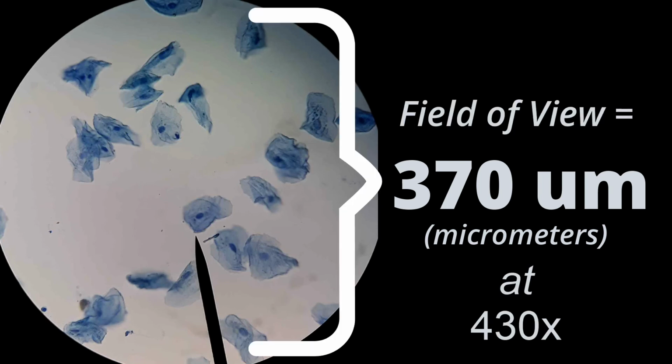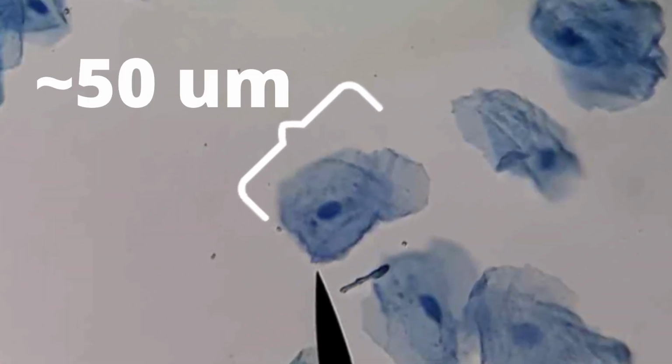So now we know the field of view at 430x, and we just do the opposite of how we estimated the tree size. We'll take one of these cells, and if we pretend to line them up across the field of view, we can estimate that about 7 of them would fit end to end. Now just divide the field of view, which we know is 370 micrometers, by 7, the number of cells that would fit across, and we can estimate that one of those cells measures about 50 micrometers long.